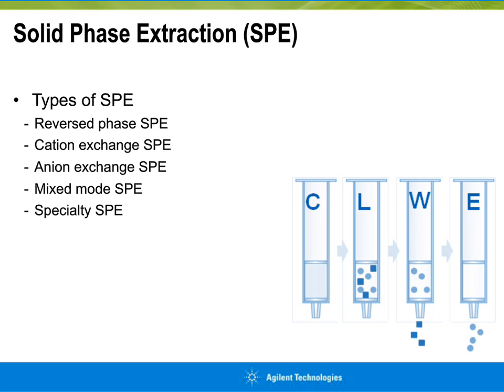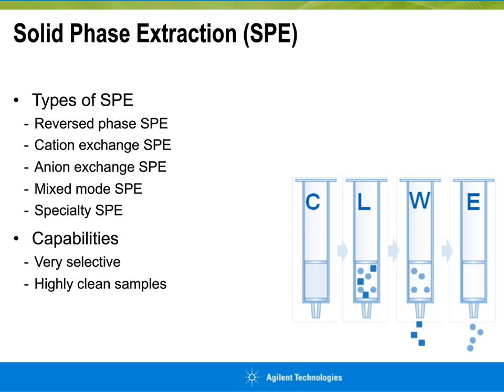Solid phase extraction has a lot of capabilities. It's a very selective sample prep technique. Highly clean samples are achieved, wide range of applicability from food, environmental, to pharma, and it is automatable.